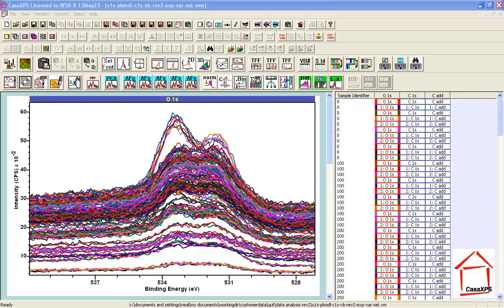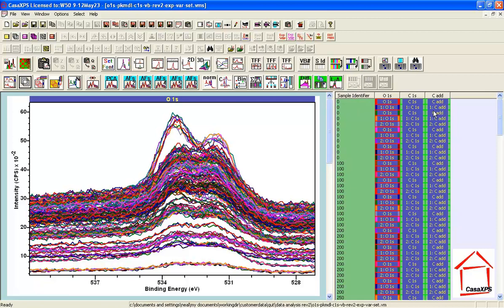One way to interrogate data is to make use of linear algebra. Linear algebra requires spectra to have the characteristics of vectors, which means we cannot simply shift spectra to align peaks. We must align spectra in terms of data bins so that the intensity in each data bin corresponds to the same data bin across all other spectra.